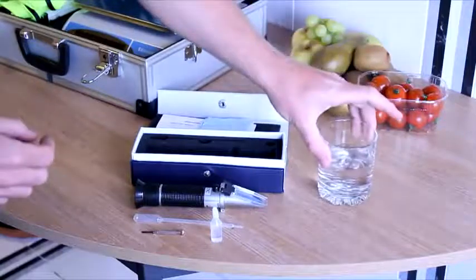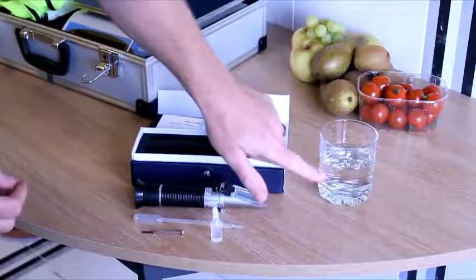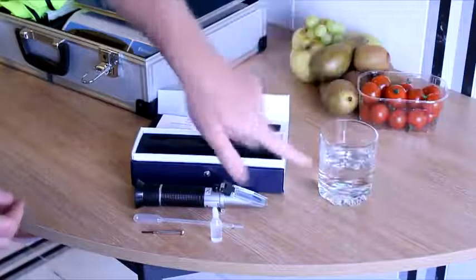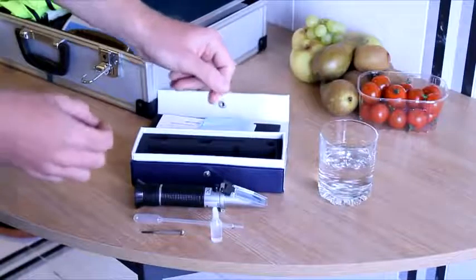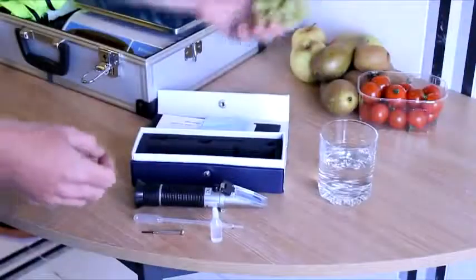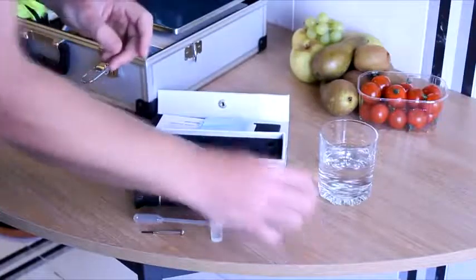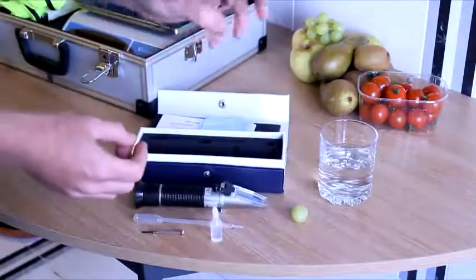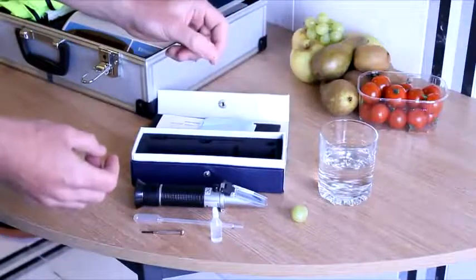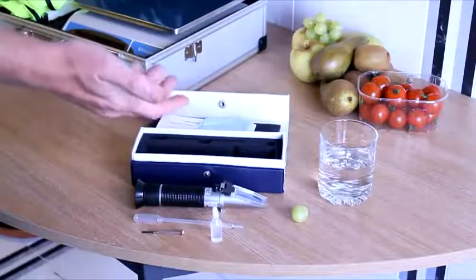So, what is a refractometer going to measure? As the name would indicate, it measures the refraction of light through a liquid. As the light passes through the liquid, its path is diverted by dissolved solids within the liquid. So the greater the diversion, the more dissolved solids. This is useful for checking on the quality of fruit, for example, as those dissolved solids are made up of sugar, and this can be an indication of ripeness and sweetness. As the fruit ripens, so does the sugar, and the greater the refraction of light.